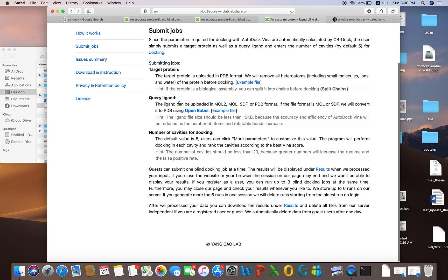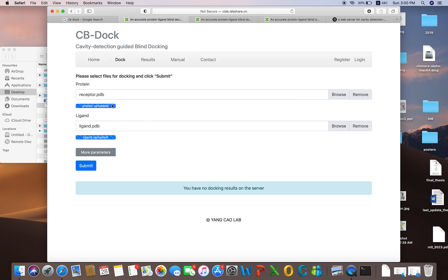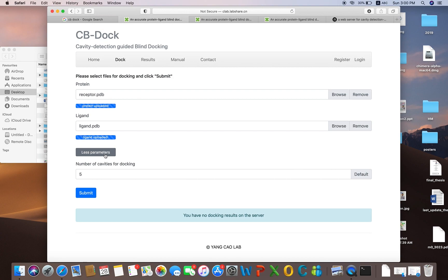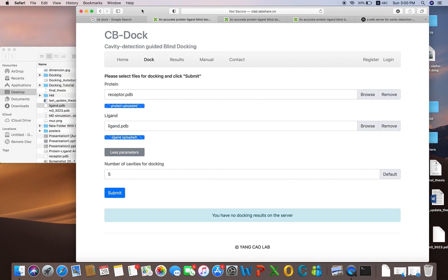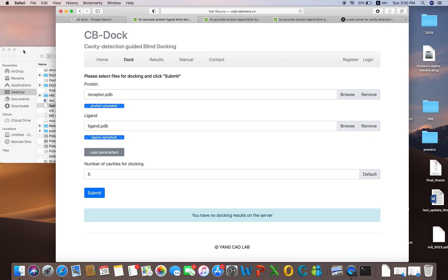The server can accept the ligand in mol2, mol, SDF, or PDB format. If the format is mol or SDF, the server automatically converts it to PDB format — it has built-in OpenBabel. If you do not know OpenBabel, you can watch my other videos in which I have discussed OpenBabel and how it works for converting the format of the protein and ligand.